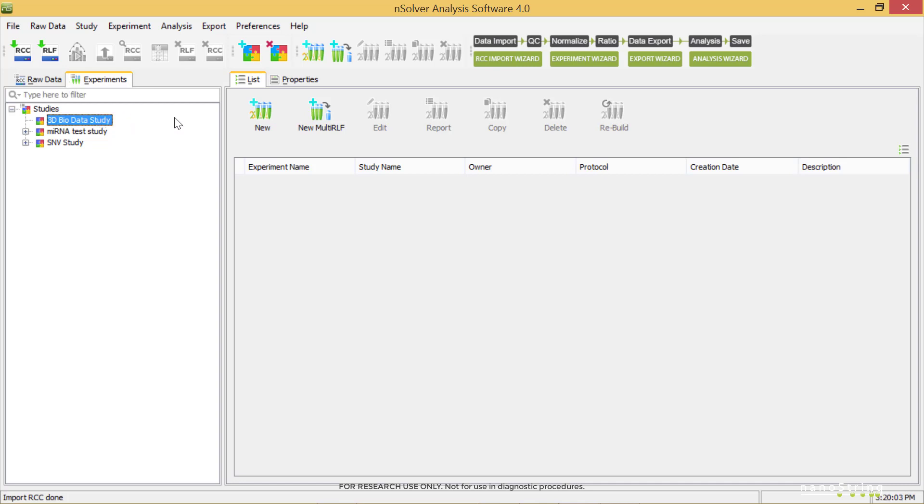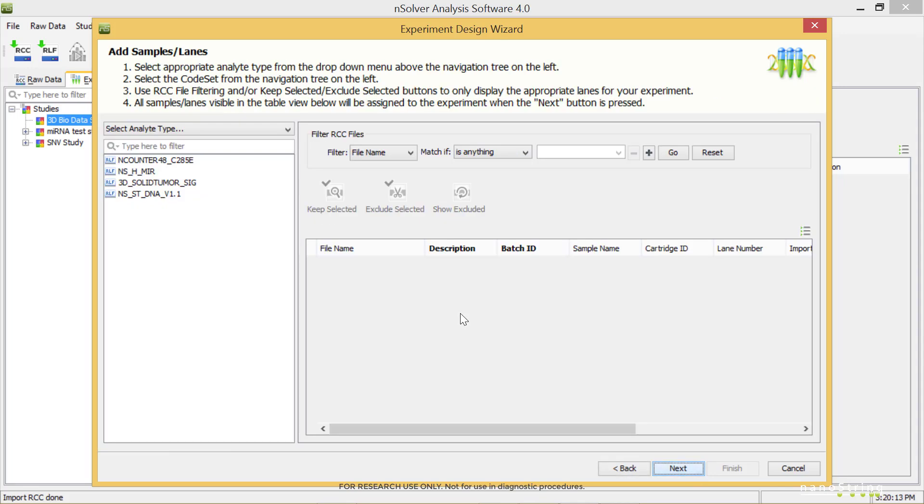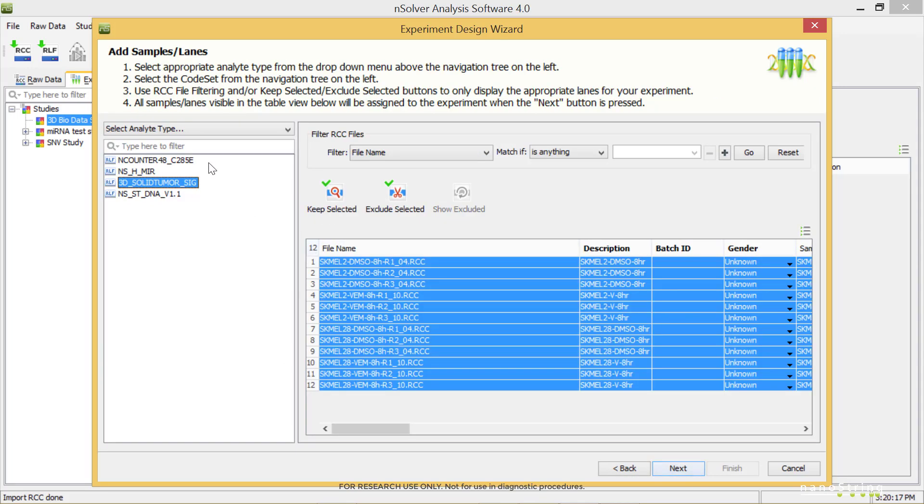Now, we'll select a New Experiment button on the main dashboard and enter a unique experiment name. Select Next. We'll select the 3D Solid Tumor SIG code set, and then select the samples we want to include in the experiment. For this example, we'll use all the samples in the dataset. Select Next.